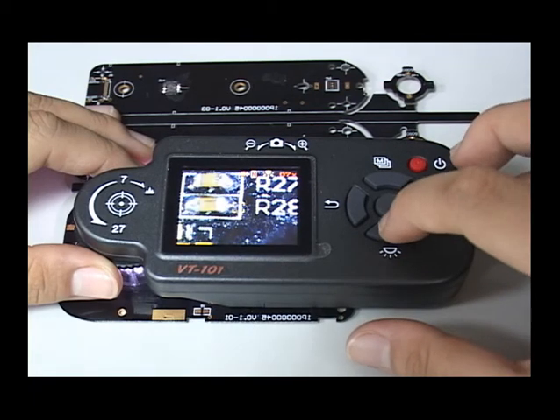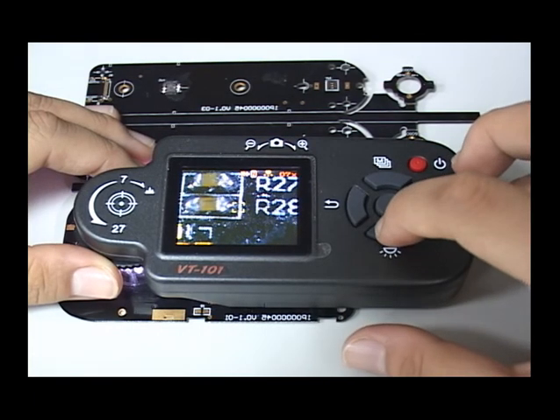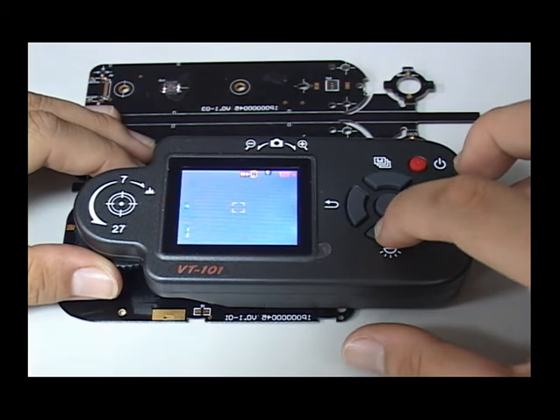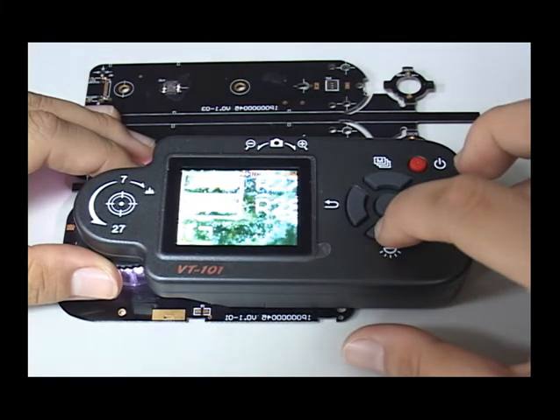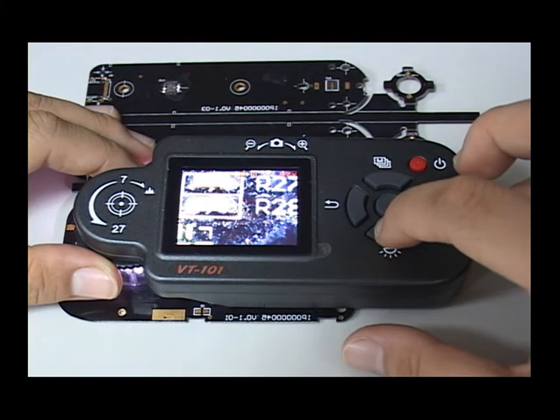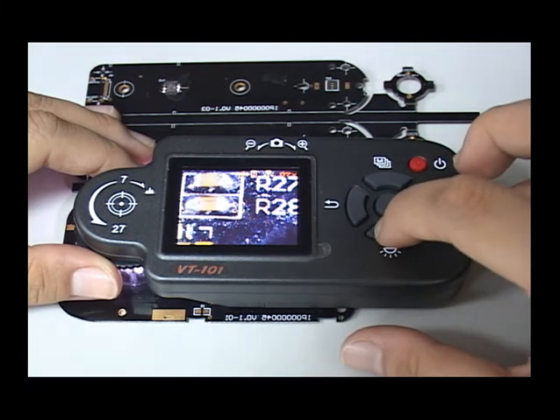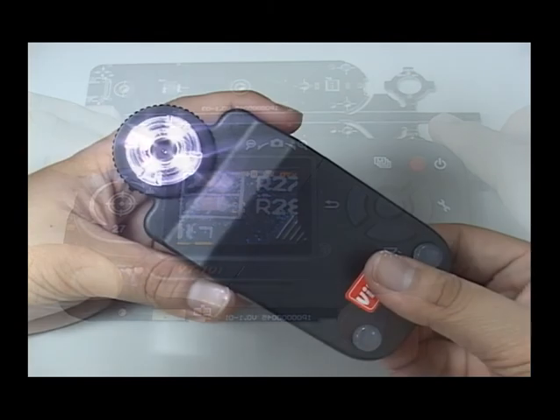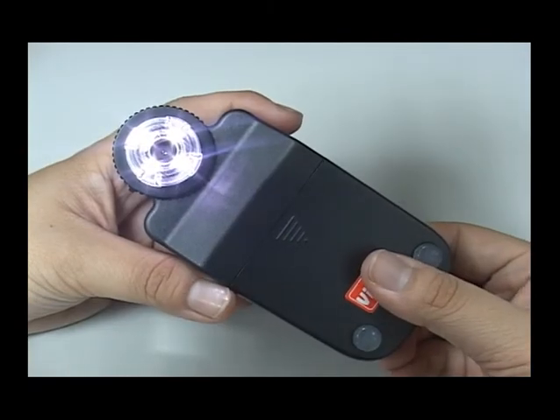Press the button to adjust the brightness. As per different observations, you can adjust different brightness levels to help make the observation easier.